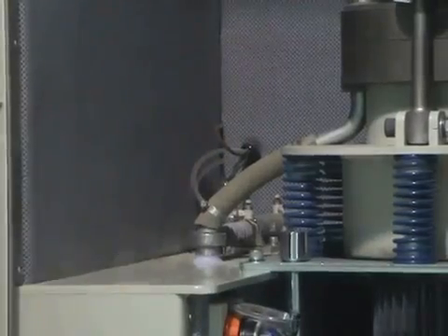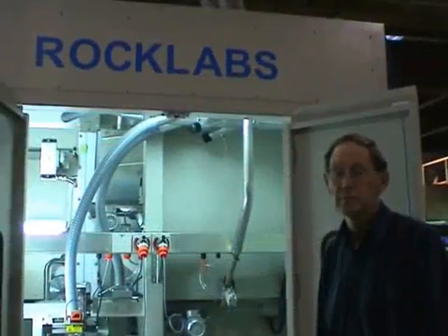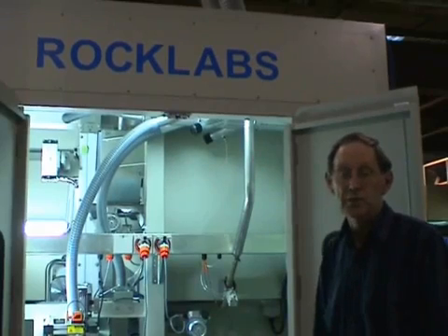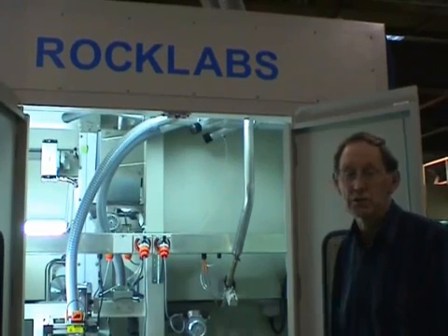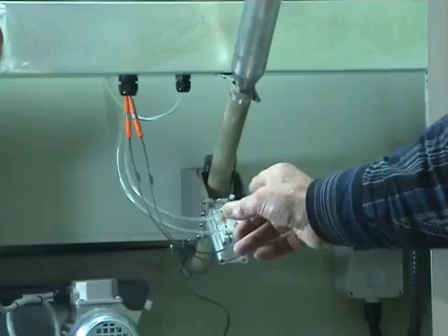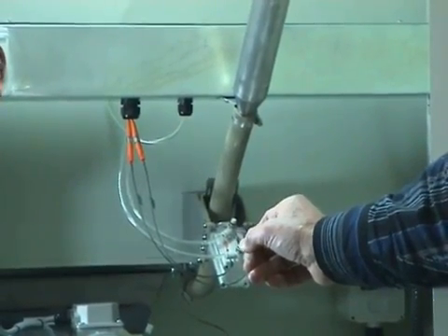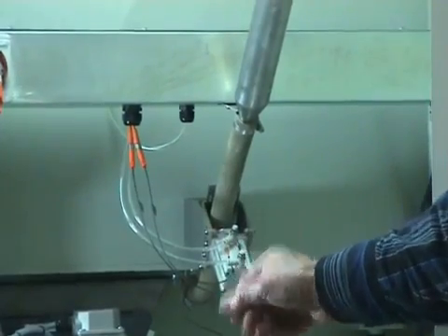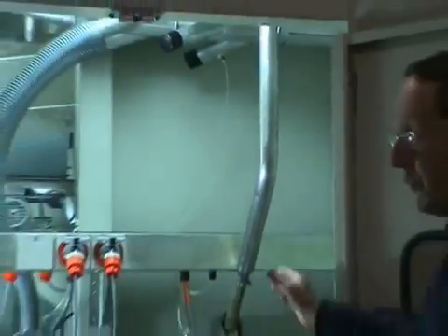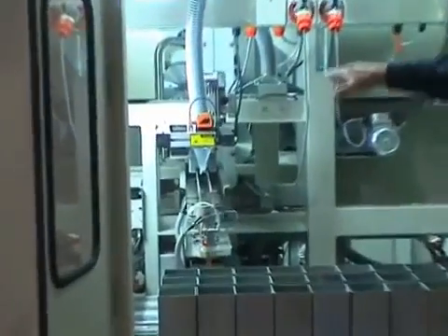The sample heads towards the final splitter in the process, which will divide the pulverized material into three portions. After the sample has been pulverized by the continuous ring mill, air is sucked through the mill while it's running to remove the last few grams of powder which might be left in the mill, and then the mill is ready for the next sample. The sample travels down the feeder to the last sample splitter, which is in the rear of this cabinet.